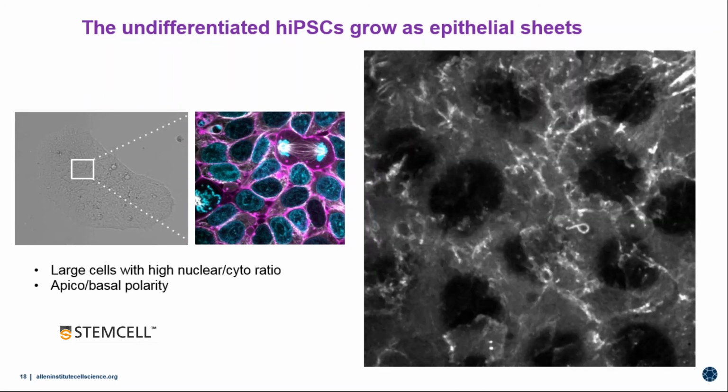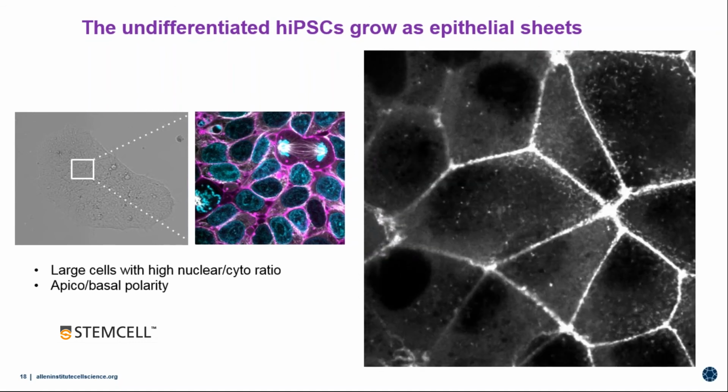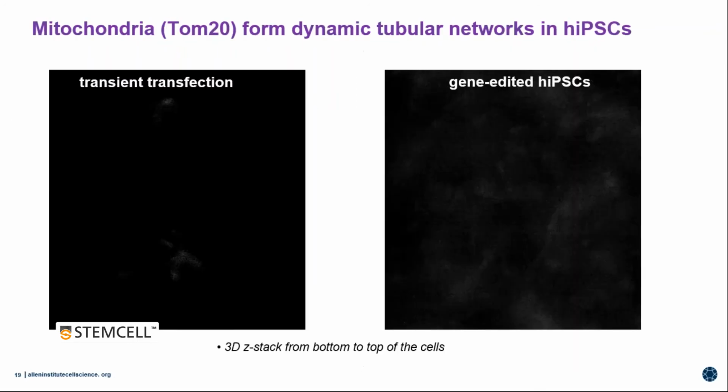I mean, this is somewhat high end. And there's no background because there's no staining artifacts. So you can get a lot of information from just really good confocal microscopy.